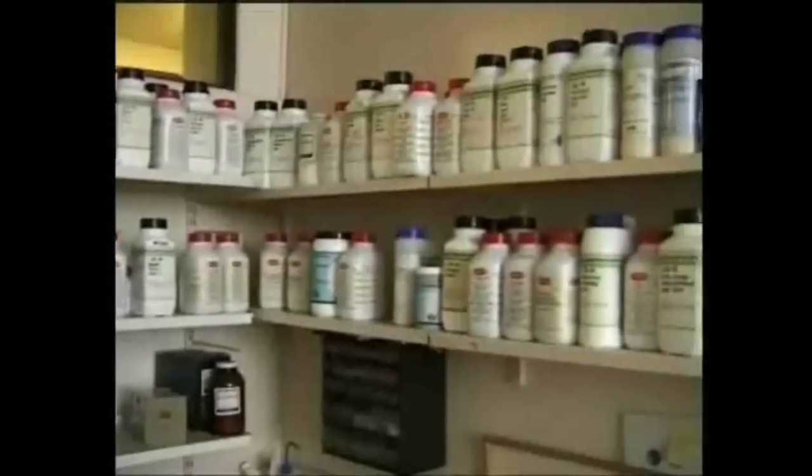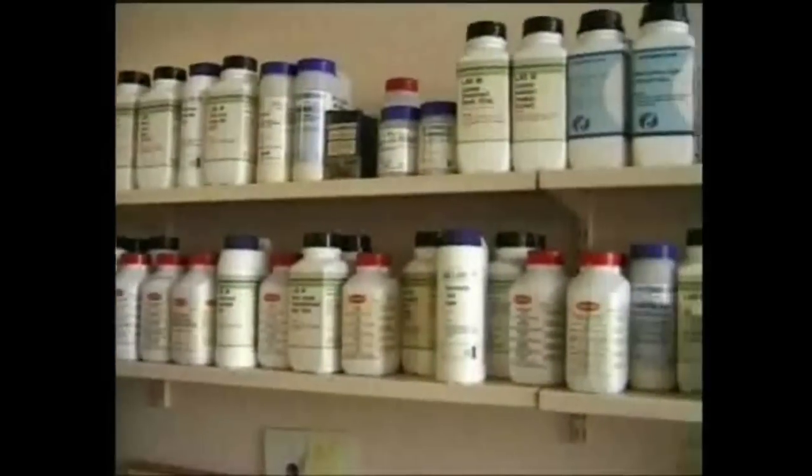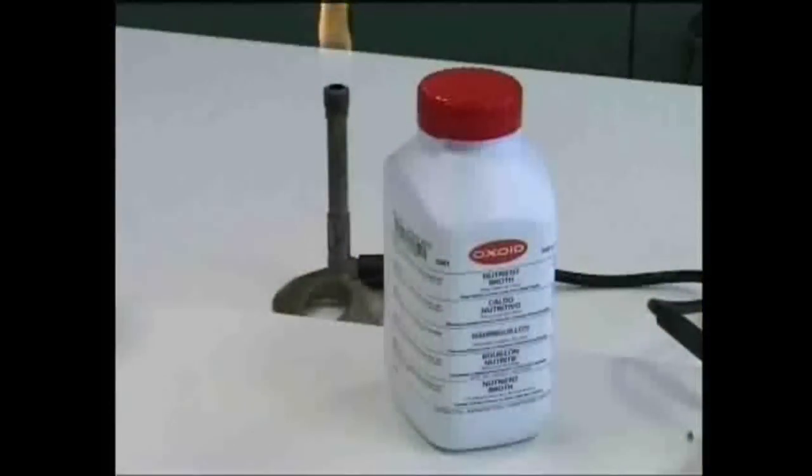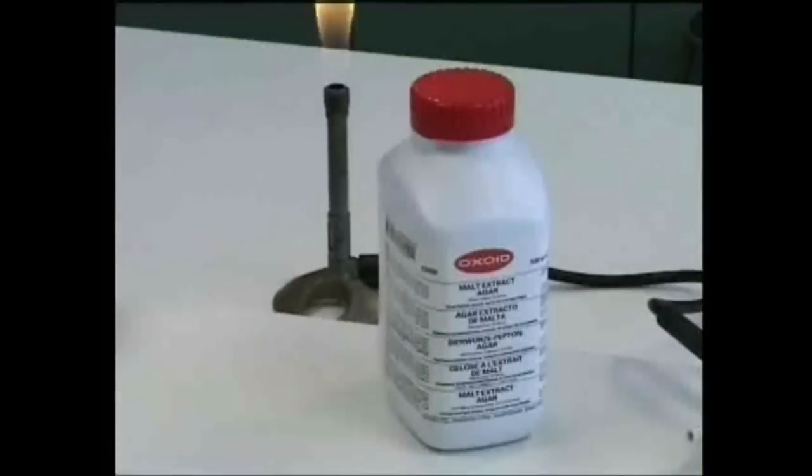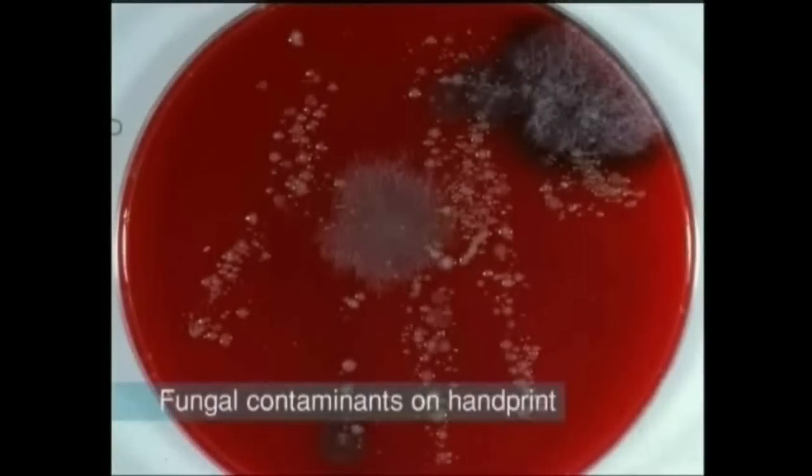There are many different types of media containing various combinations of nutrients, but a good general medium for bacteria is nutrient agar. Fungi have different nutrient requirements from bacteria, and so nutrient agar is not the best medium for them, although they will appear as contaminants quite readily.